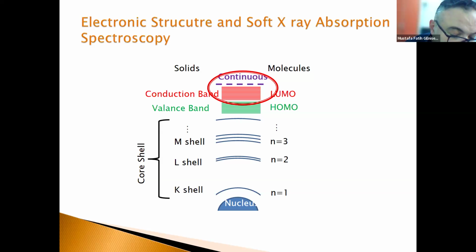Yes. So my work is on photocatalysis and using a photocatalyst like bismuth vanadate. I would like to ask a question about band gap. Band gap measurement is done by using absorption techniques, sometimes UV absorption using a UV-visible spectrophotometer. But here, for X-ray absorption spectroscopy, can we use it also for this purpose?